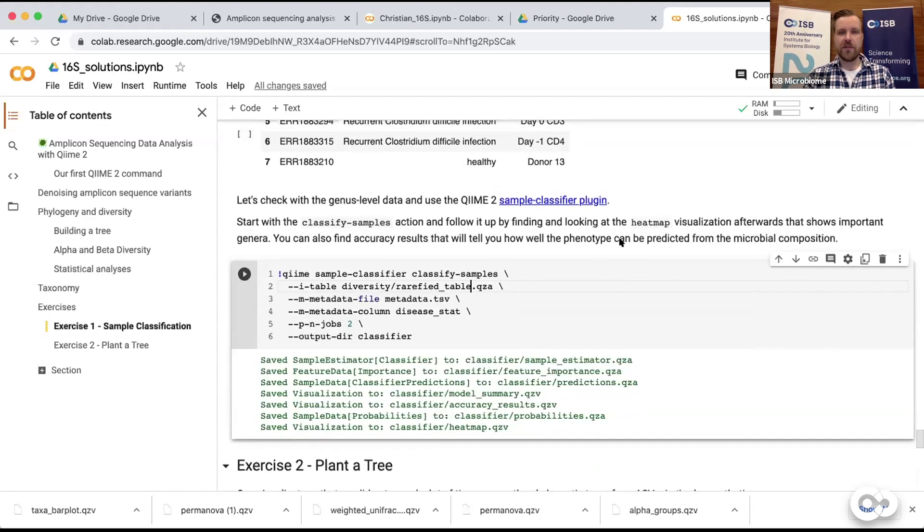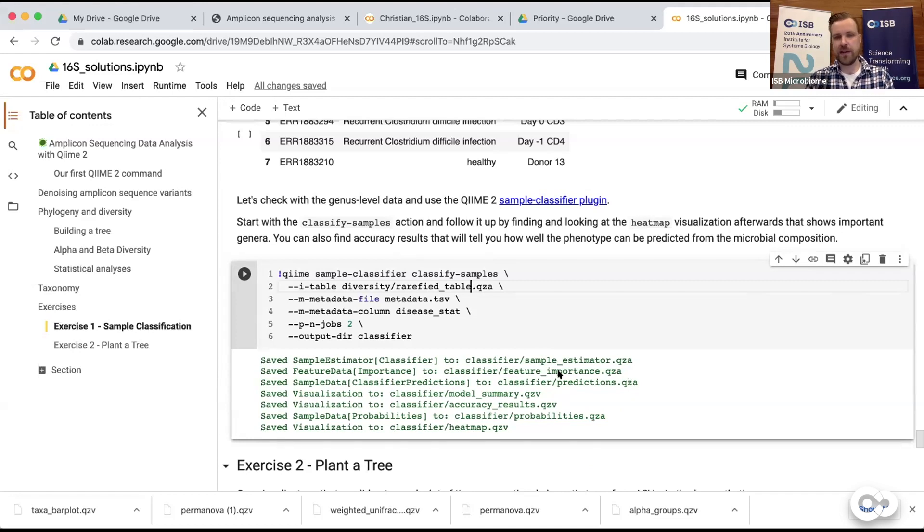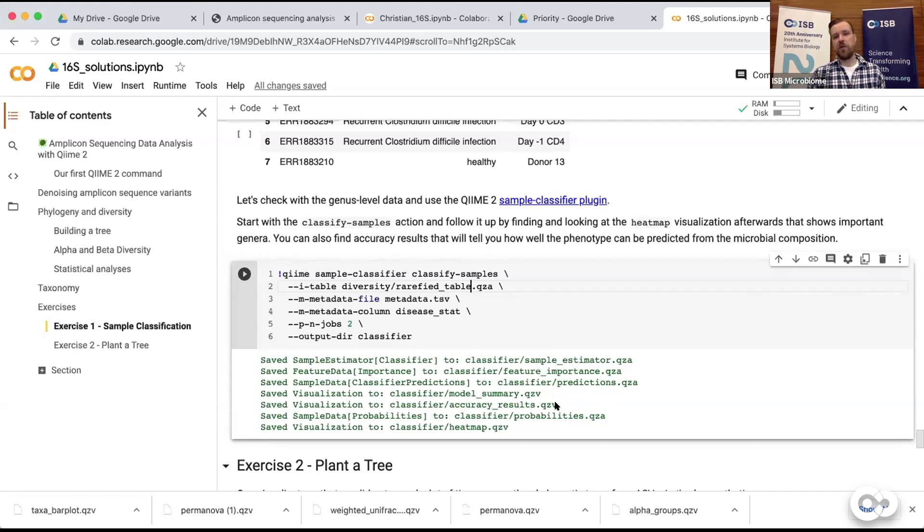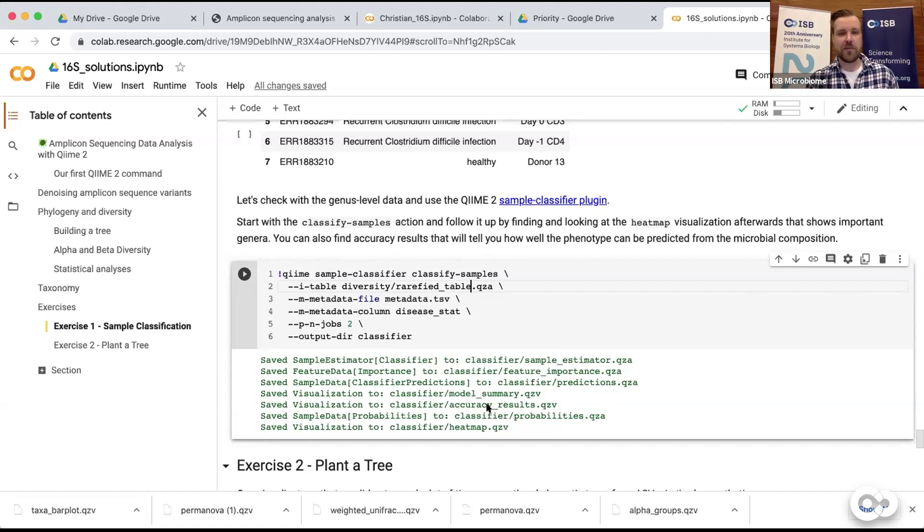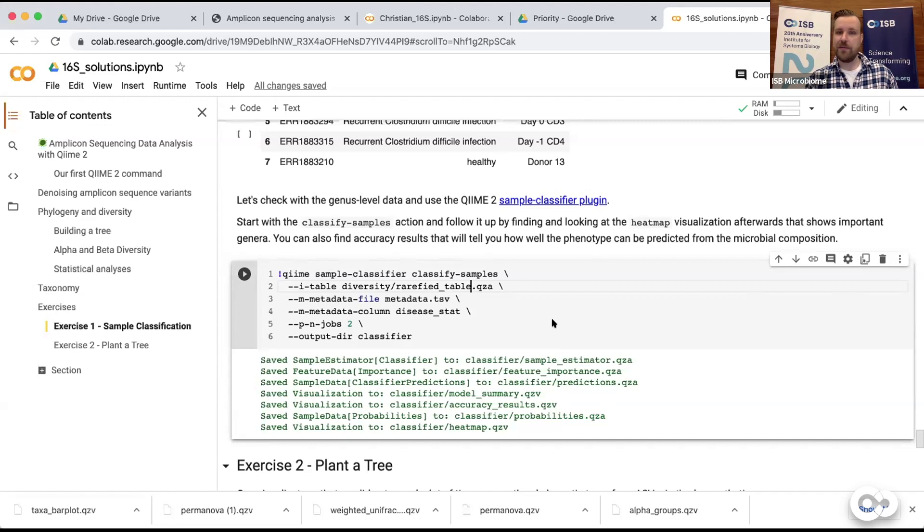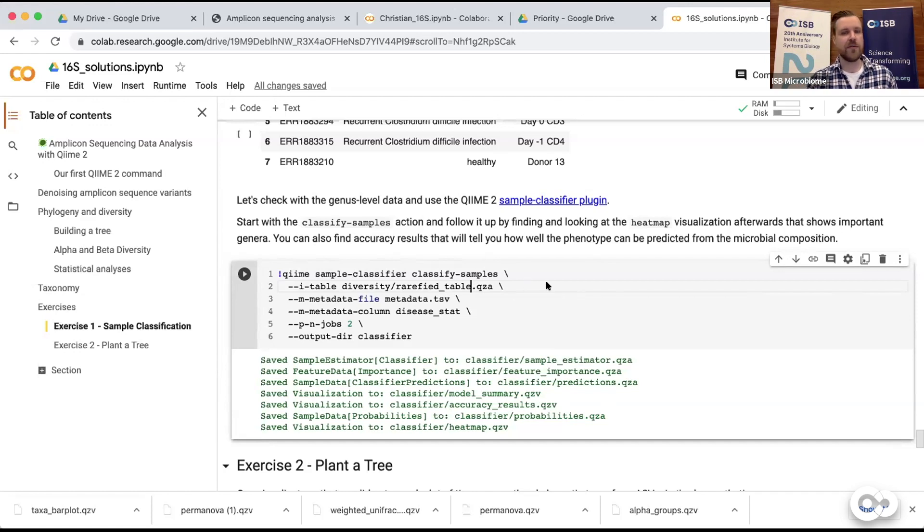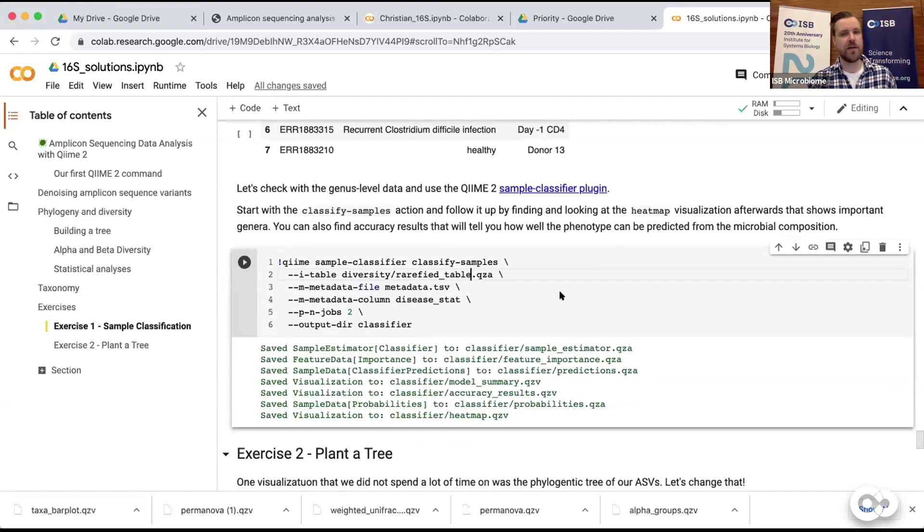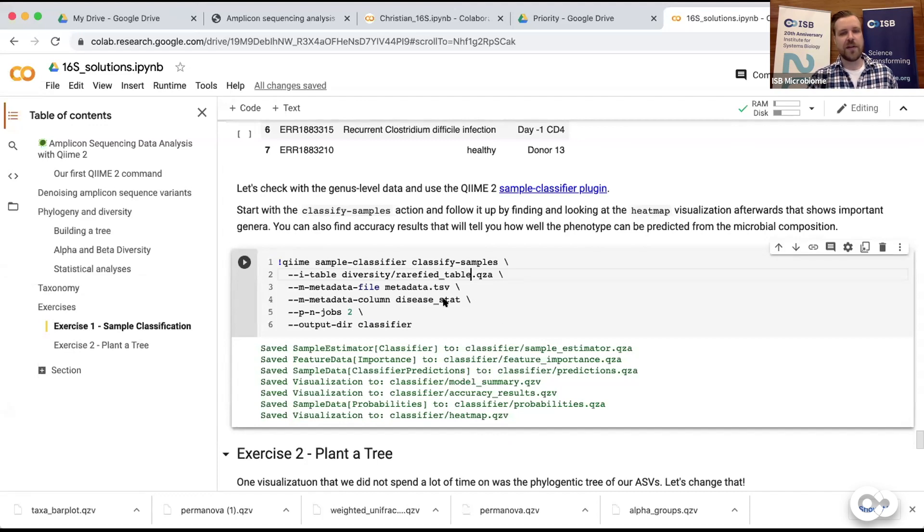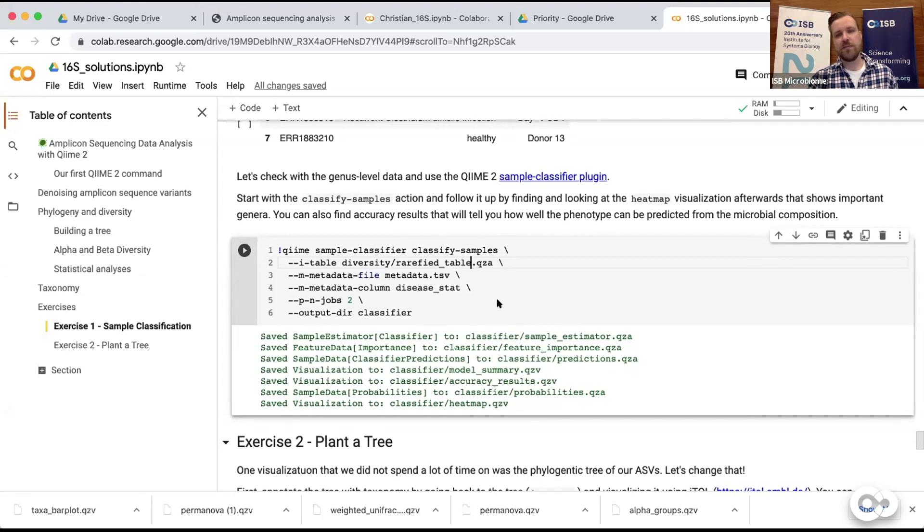Then you could have also looked at the accuracy, and that would have told you how well it does in predicting the C. diff state. That would have been the accuracy results visualizations and actually would have told you that's almost perfect in differentiating sick from healthy individuals. But there's a little problem here - we only have eight samples in our dataset. That's not really a big study; most 16S rRNA sequencing studies these days have hundreds to thousands of samples. The largest American Gut Project by now has up to 30,000 samples. It turns out that we often get overfitting with low numbers of samples.